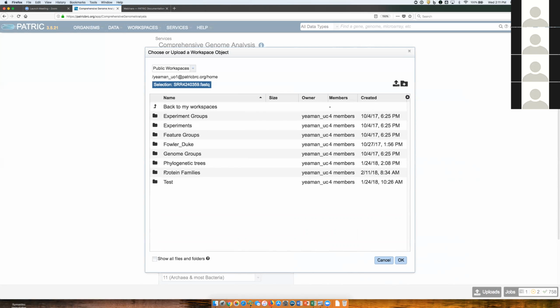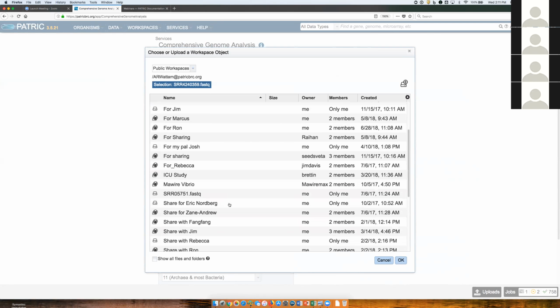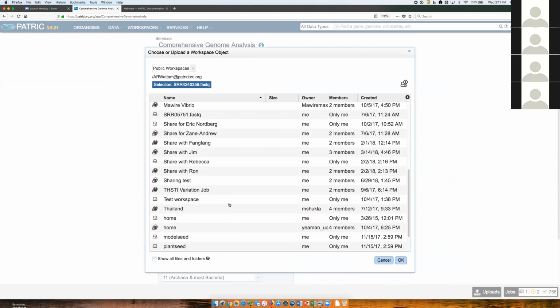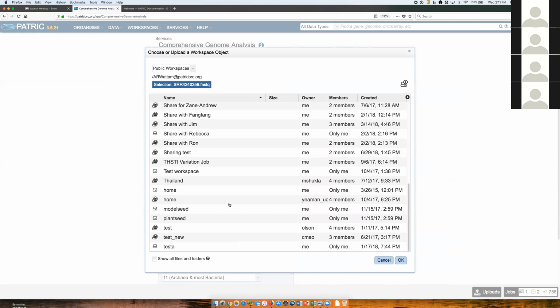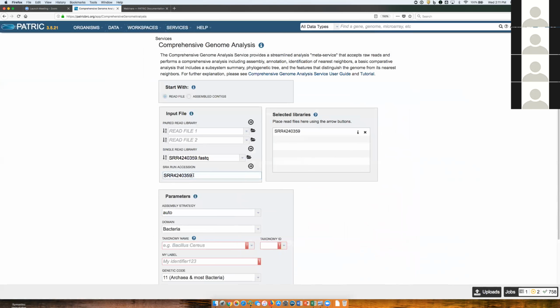And then, well, shoot. I'm having a little bit of trouble seeing that right now. I'll work it out. We've got a simultaneous workshop going on in California, and it may be altering this. But for now, let's just use this and move it over.